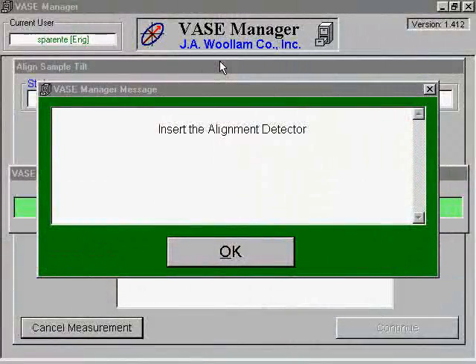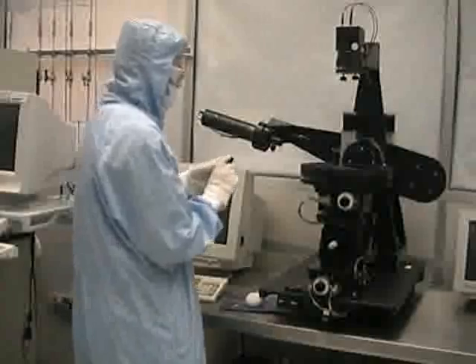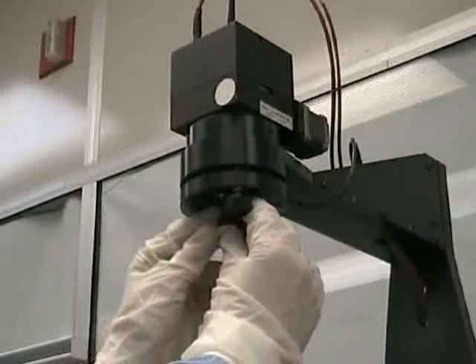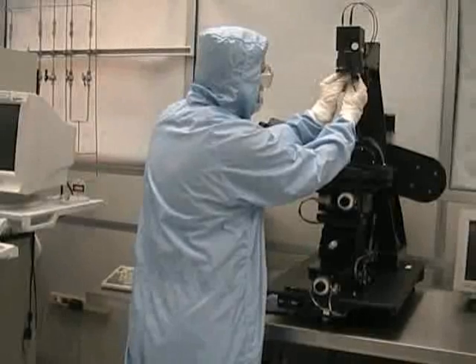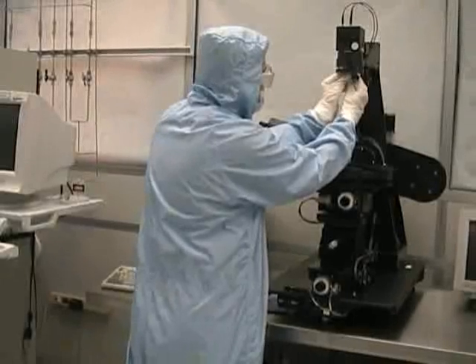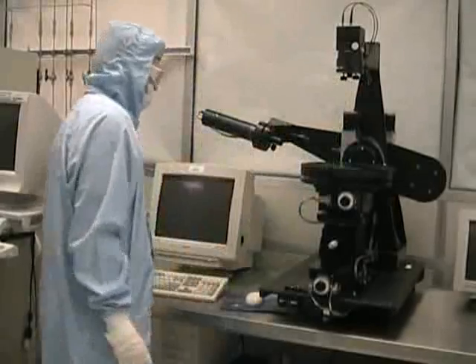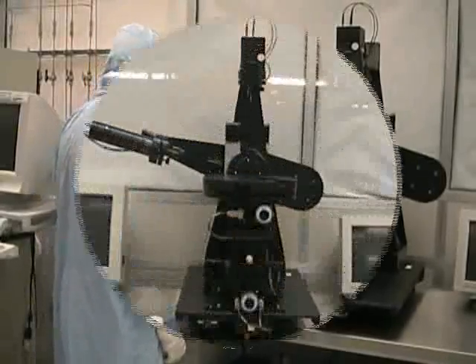After a few seconds, the system will prompt you to insert the alignment detector into the alignment detector socket, which is located in the center of the polarizer. The alignment detector can normally be found in a slot towards the back of the machine on either the left or right side. As you insert the alignment detector, keep the longest pin or guide pin facing you and keep the detector vertical. Slowly and very gently push the detector up into the slots of the polarizer. If done correctly, the detector will easily slide in and hold.